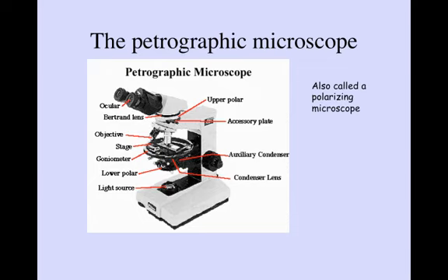All right, the parts of the microscope. This happens to be a binocular microscope. It has two eyepieces that you can look through, two oculars. A lot of the microscopes in our classroom are monocular microscopes, and those work just as well. Let's start at the base of the microscope, down here by the light source. Most of the microscopes in class have a power switch for the light, and they have some way, a knob or some adjustment, to change the light intensity. So you can use low light up to very bright light to shine through your microscope.